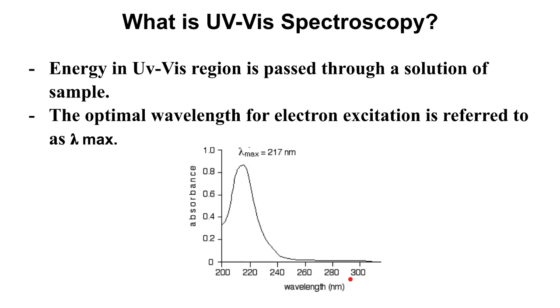You put it into the instrument and close the lid, and then it's going to scan through a bunch of different wavelengths, and you will find the optimal wavelength, which is known as the lambda max, which is where you're going to hit the best absorption of that light, so it doesn't come through to the other side at the detector.